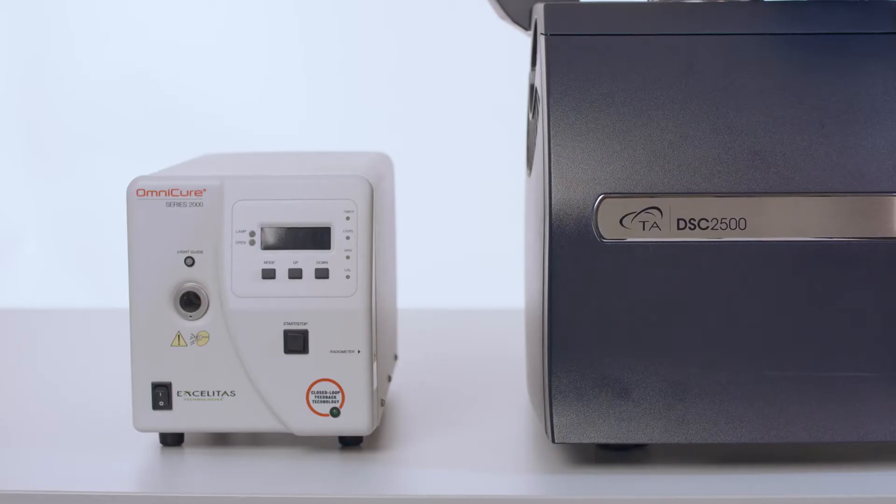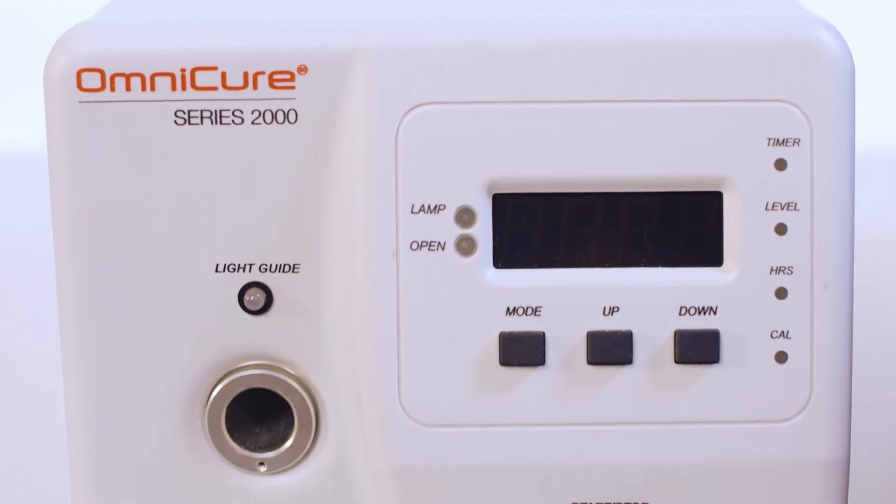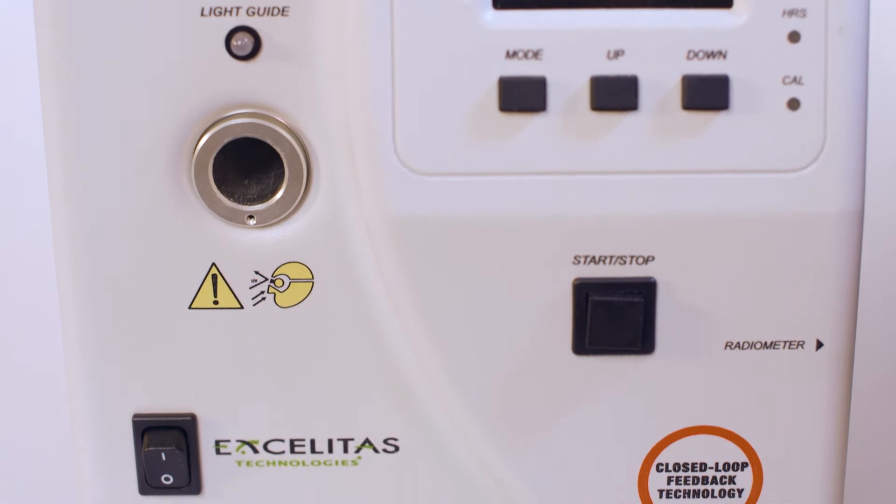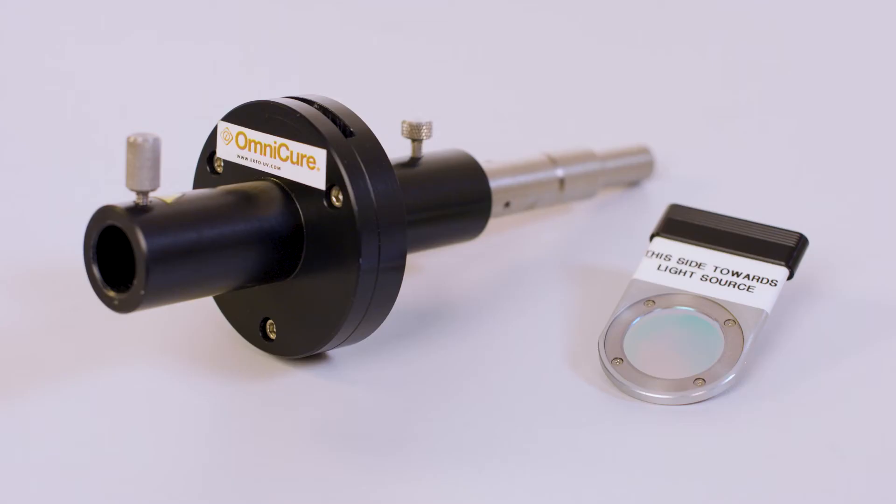A broadband filter supplied with the instrument covers 320 to 500 nanometer and is suitable for most UV and visible PCA studies. Additional filters are available for use with the PCA UV external filter adapter accessory.